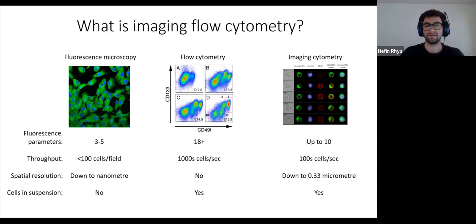So if you need to image extremely small structures or resolve very small structures, then most microscopes can go down to nanometer resolution, depending on how much you paid for your microscope.